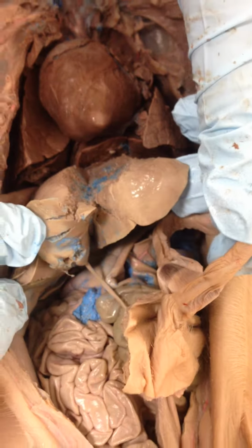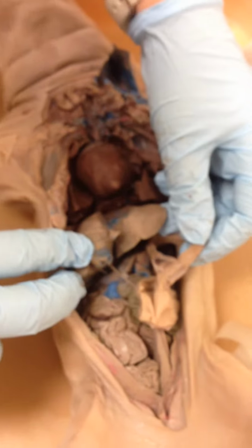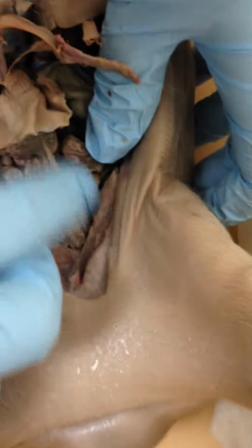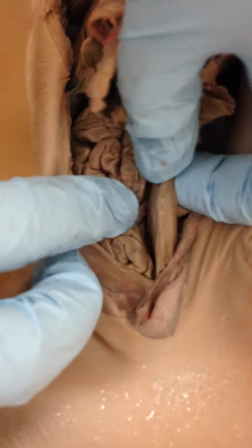Next up, we're going to look at the hypogastric arteries, and they come off from the heart and go towards the urinary bladder. Okay, so this is the urinary bladder over here. And then they are right here. They are on either side of the urinary bladder, one right here and one right here. Hypogastric.